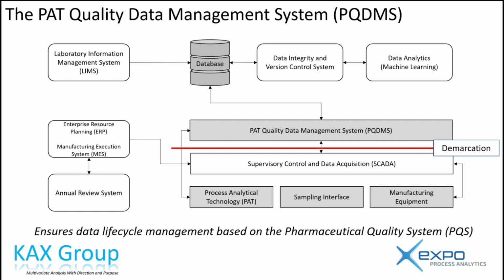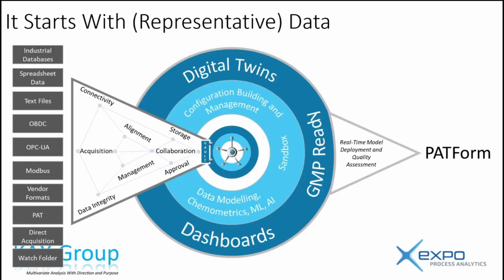And then everything else, you've got your ERPs, your laboratory systems up here. We want to be able to take exact data from here, send it up into a database, link it up to a LIMS system, marry the two pieces of data together, model it, make the models, push them back down, and utilize them. The whole point is utilization. A model on a computer that's not being used is just a pretty picture. Sometimes it's an ugly picture, but it all depends on how we do. So, just a little bit of an overview of how everything comes together.